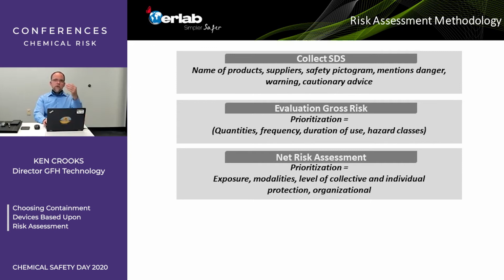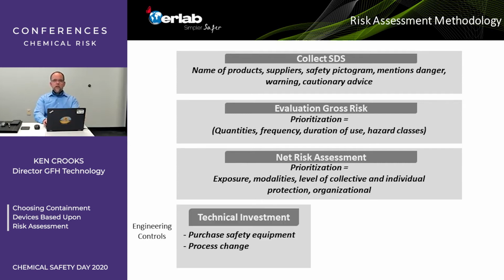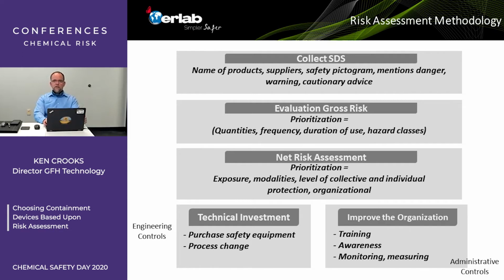And so once you know these and you go through this assessment process, you can then choose your technical investment, right? So which safety equipment will you purchase? What process changes do you need to make? And so that's your engineering controls, sorry, if we go back to the fundamentals. You also need to improve your organization.